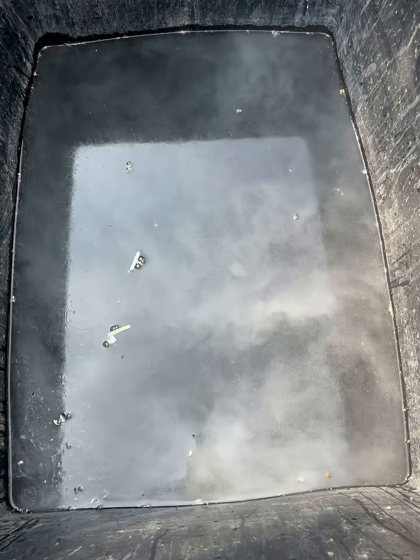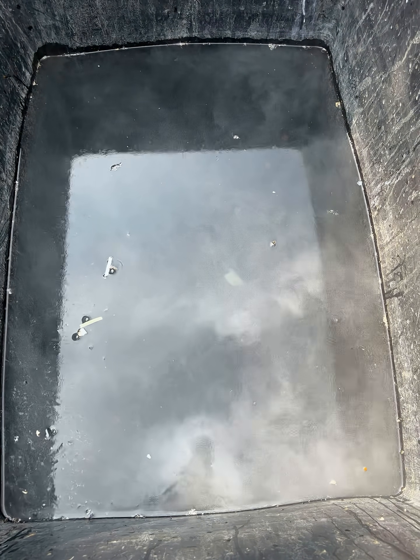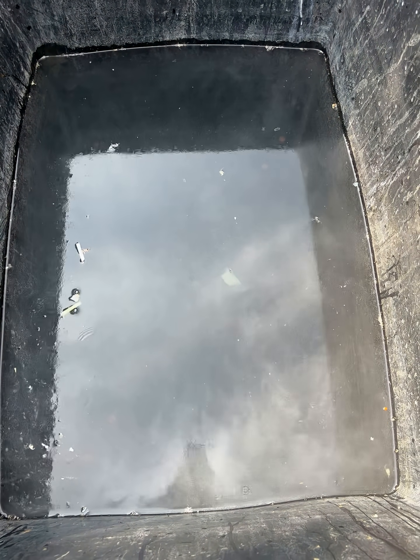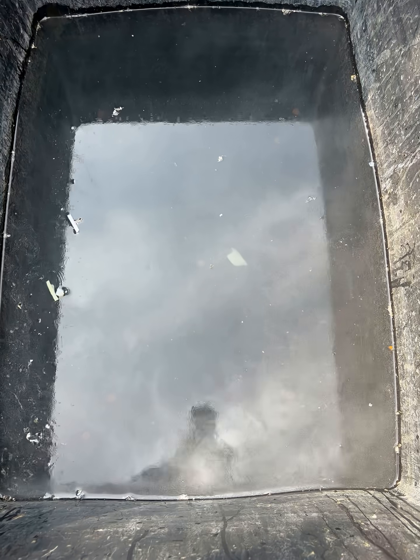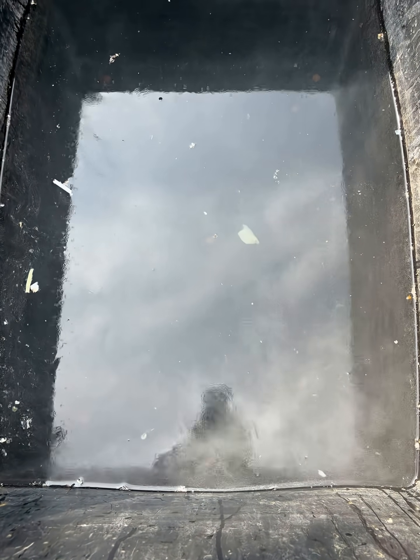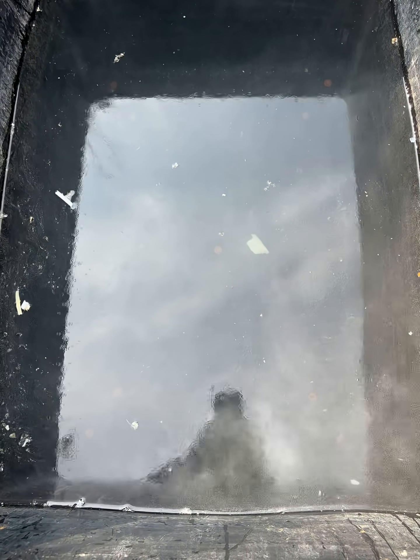Oh look at that — the water is turning clear! That's amazing, this is beautiful. I love that! Look at that — oh god, chemistry is fun, it is fun!